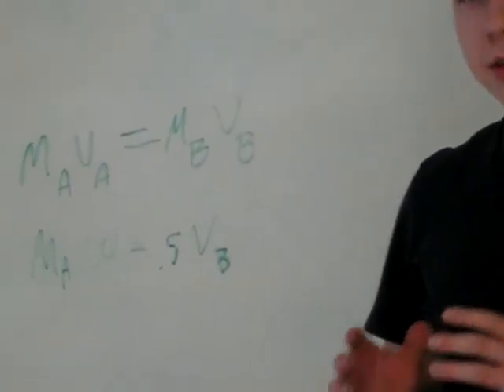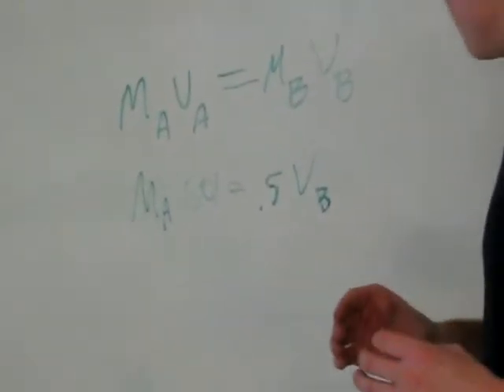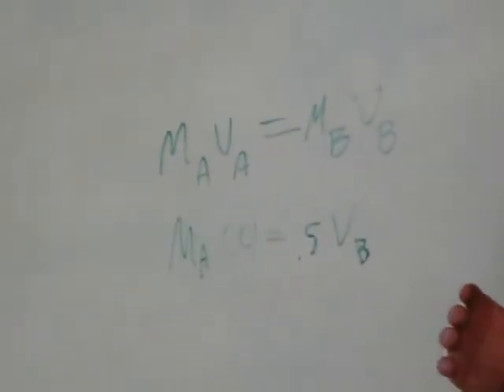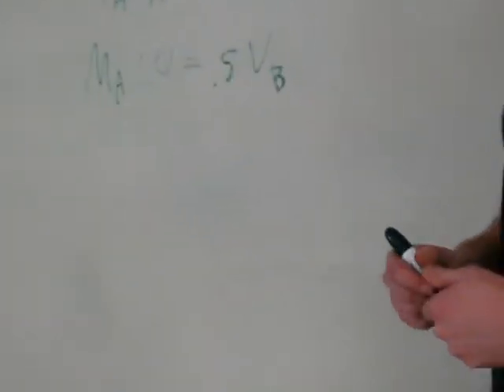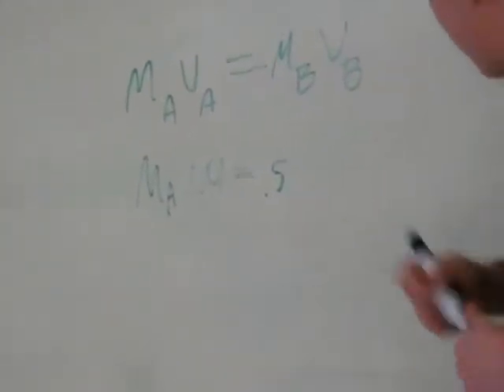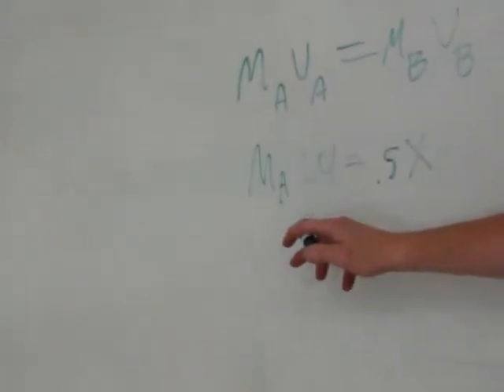Once the acid turns pink and remains pink for a good amount of time, then we know that we have reached the point where the acid is neutralized. Then we take the reading of the amount of base that we've used, which will be our volume of base in this equation, and then we can plug that in and solve for molarity of the acid.